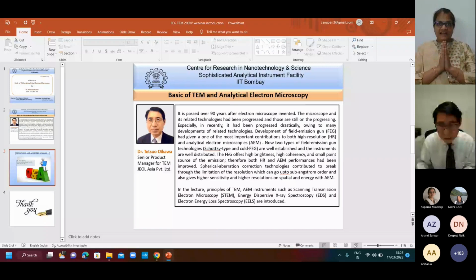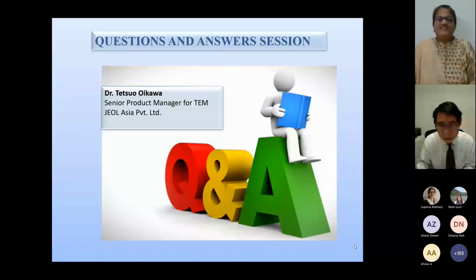Thank you, sir, for an informative talk. We have certain questions lined up for you. And the first question is, can degree of twist be determined for chiral structures like DNA using TEM?